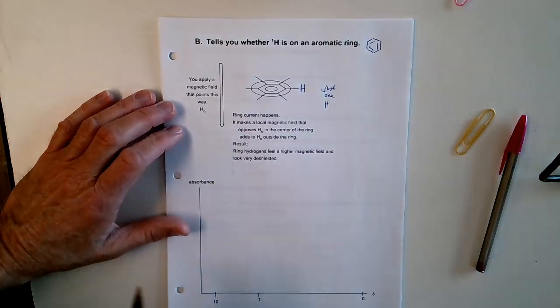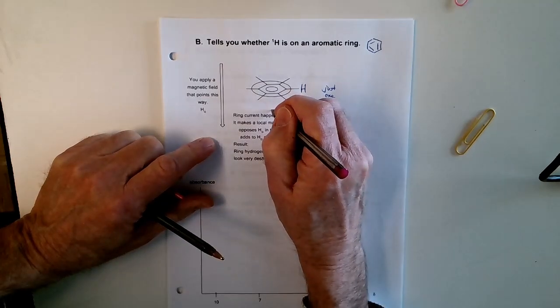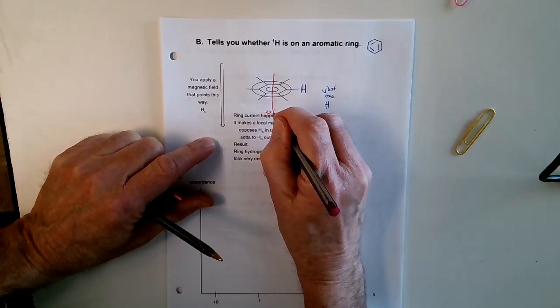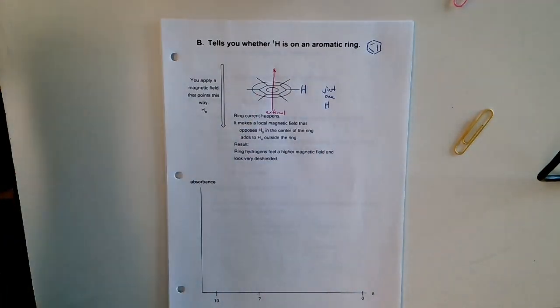Just one hydrogen. And what happens is you envision the external field, the magnetic field, coming in from this direction. Okay, here's the external field. Remember, we have decided that in order to do this at all, you've got to live inside a magnet. They're big. So there's what happens.